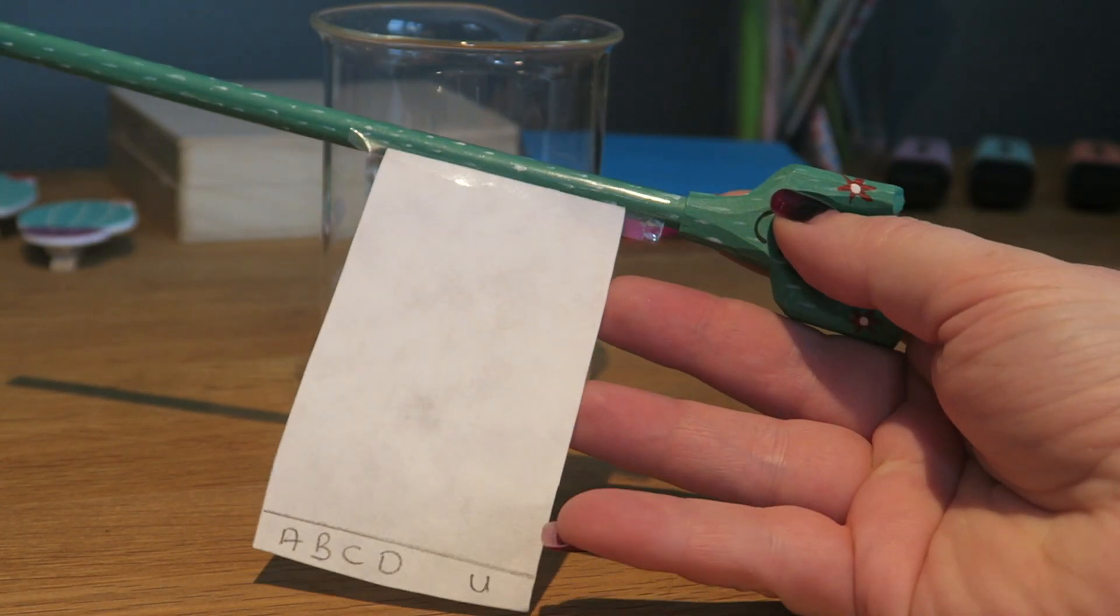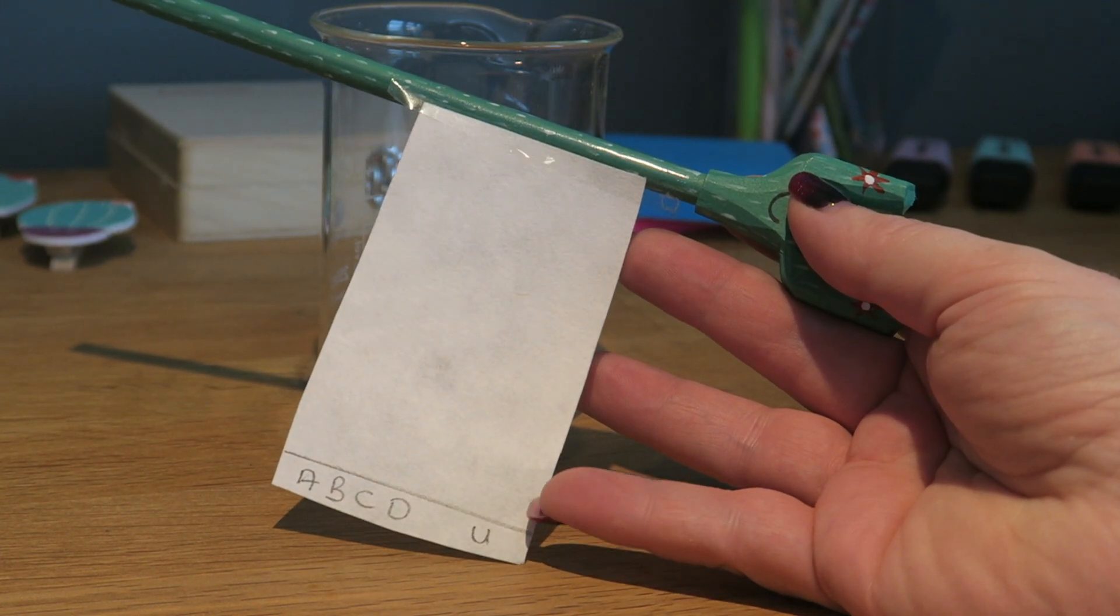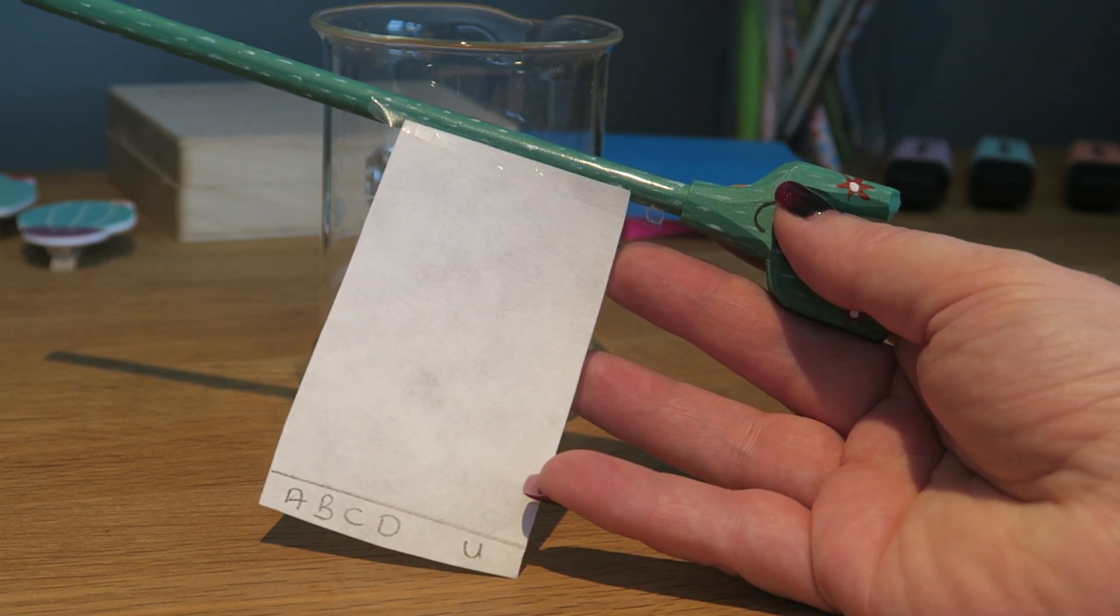For this practical you need a bit of filter paper with a start line or origin line that has been drawn in pencil. If you draw it in pen then the pen will run and it will ruin the experiment.